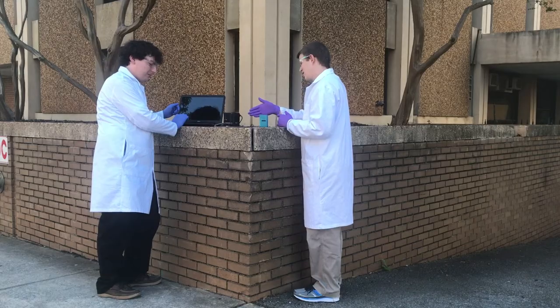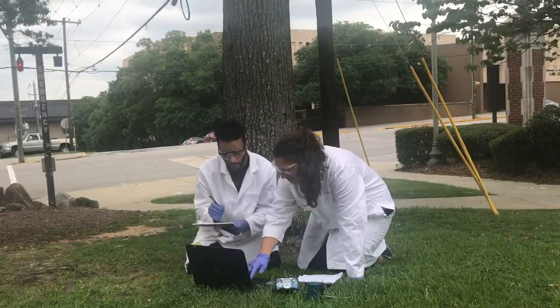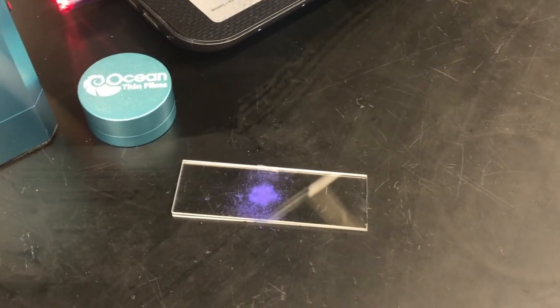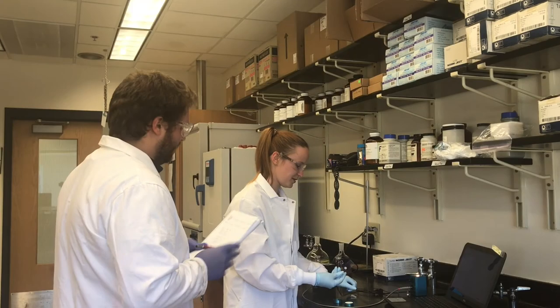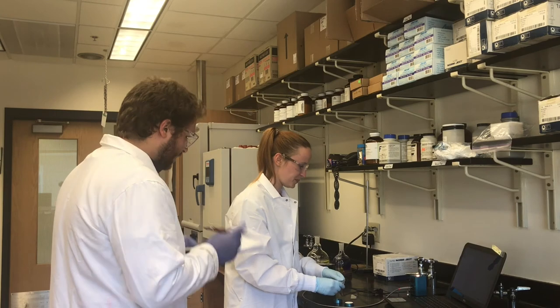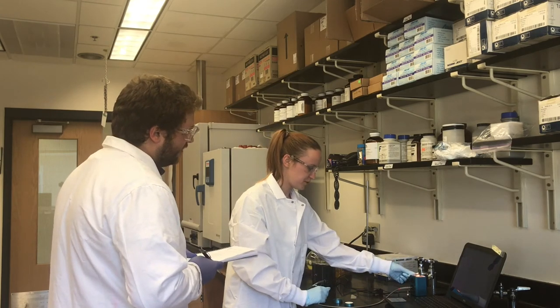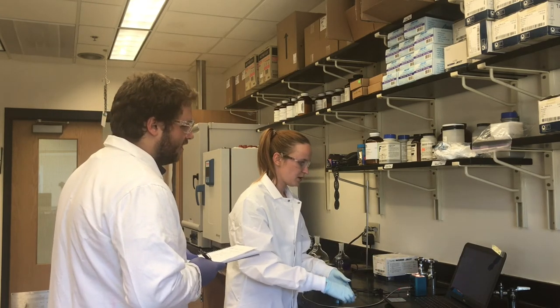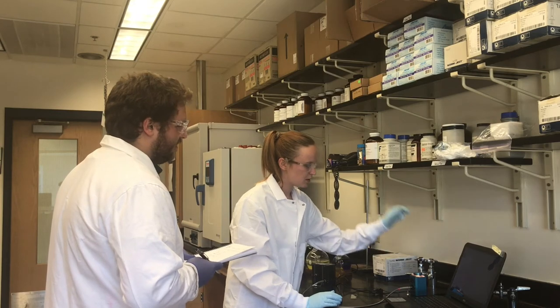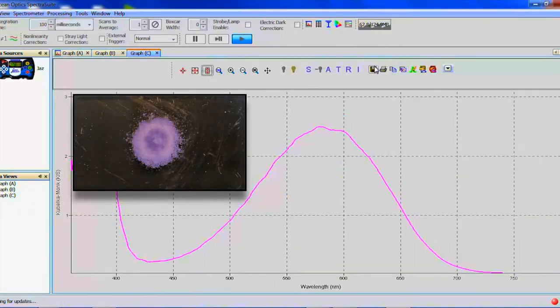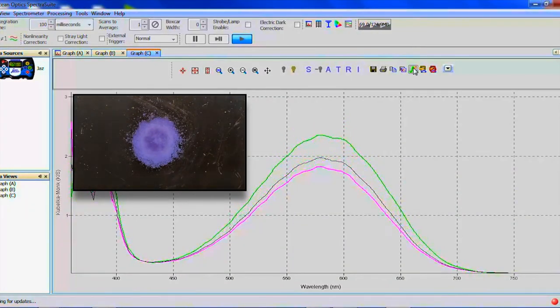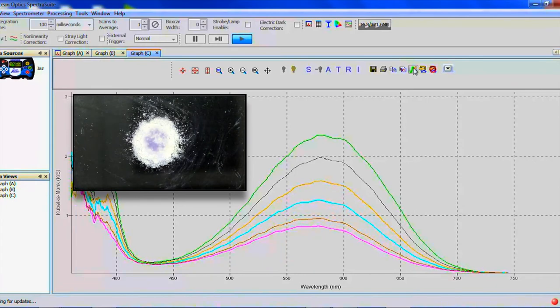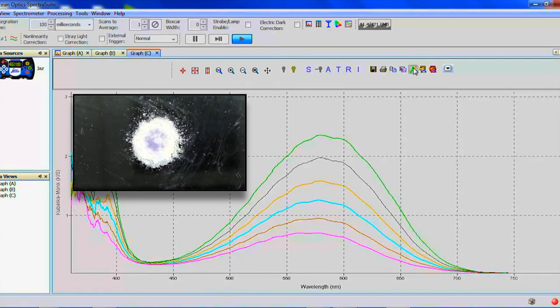The main advantage of this technique is its usage in different environments. Using a calibrated instrument, we start with the colored form of the molecule between two slides. The sample is placed on the integrating sphere and covered with the reflection standard. Using the SpectraSuite software, changes in absorption profile can be monitored in real time.